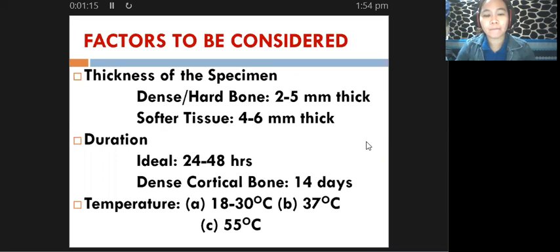Hello again, guys. This is the second video for our topic on decalcification. I will be starting off with the different factors to be considered when we are performing this step in tissue processing, which is decalcification. What are some of the general considerations we have to take note of when performing routine acid techniques? First and foremost, we have to consider the thickness of our specimen.